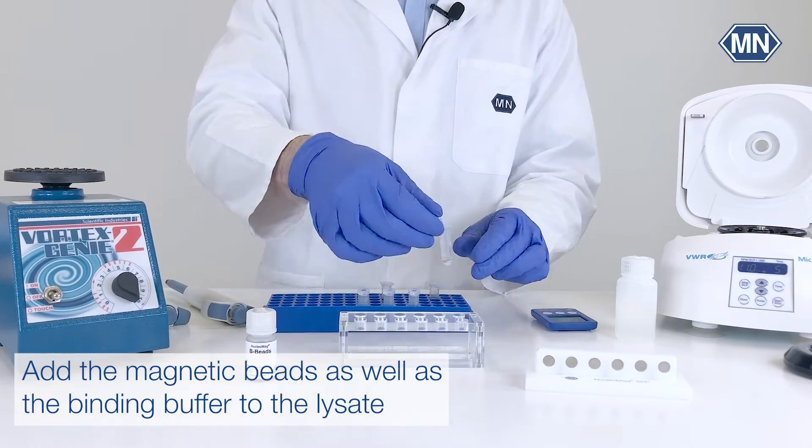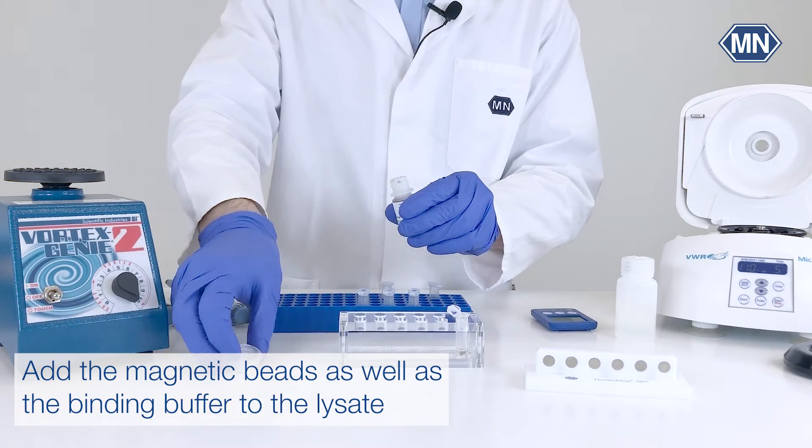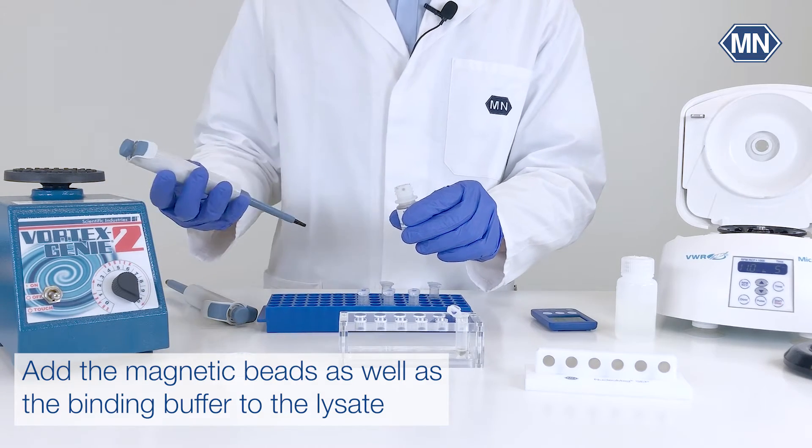Transfer the cleared lysate to the rack of the magnetic separator and add the magnetic beads as well as the corresponding binding buffer.